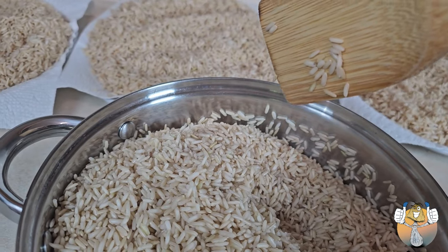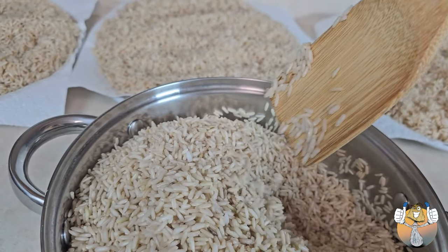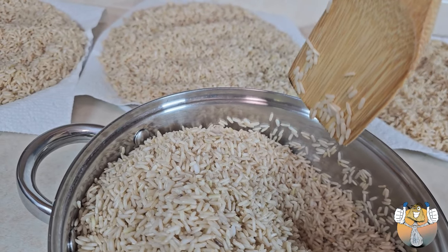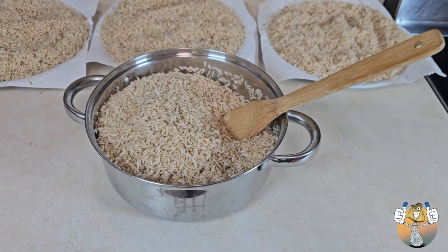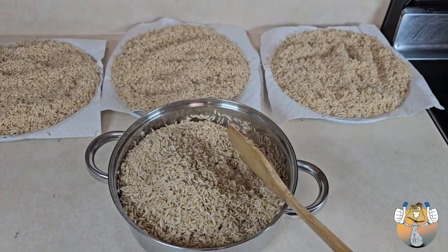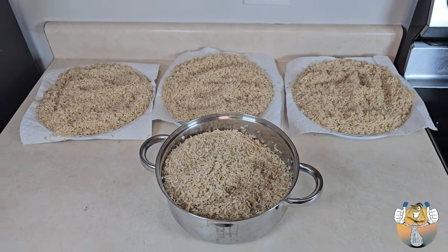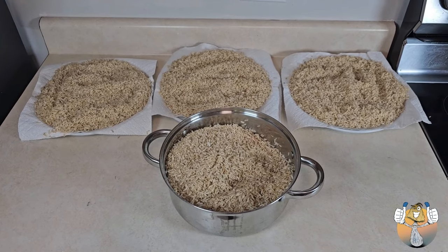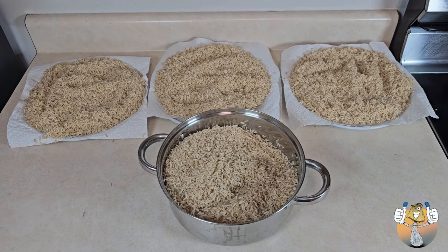As you can see, the rice is not sticking to each other. And it's barely sticking to the spoon. Once we get all that extra moisture out, we will be good to go and we can jar it up. So I'm going to continue to stir this. And we're going to let it sit for about 30, 35 minutes. And then we will jar it up.